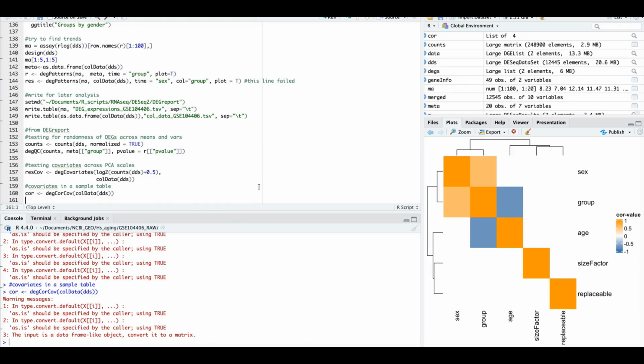What can we conclude here? That indeed this package is useful for the technical checkup of your data. It revealed with a crystal clarity the effect of the gender on the age groups, which is unfortunate, of course. Not all the figures are equally informative, but after all, this is a tool as every other tool. Use it wisely. Read the instruction. That's it.